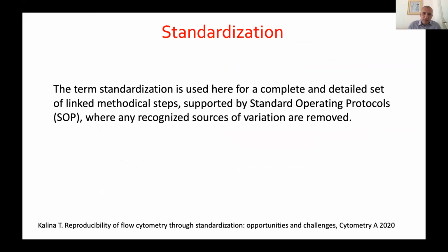So the term standardization that I use here means a set of methodological steps supported by standard operating protocols. Here we aim to remove any sort of variation that may come into that assay. Some other groups are using the term harmonization, or they use the same term standardization, but in a different context. Here we try to fix everything as much as possible and use it over and over in our and other labs as well.